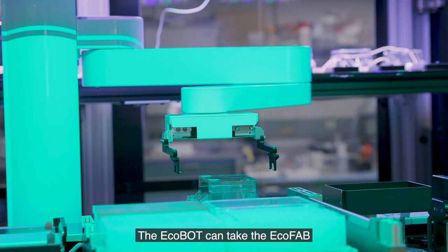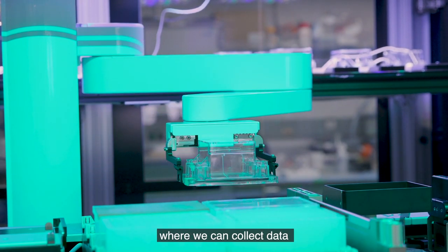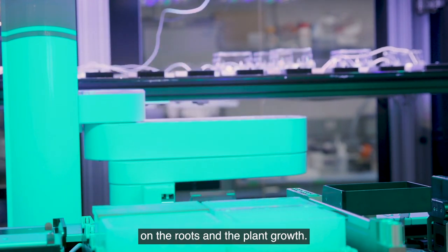The ECOBOT can then take the ECOFAB from the liquid handling unit and move it to our different imaging stations where we can collect data on the roots and the plant growth.